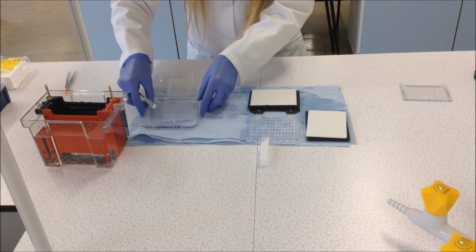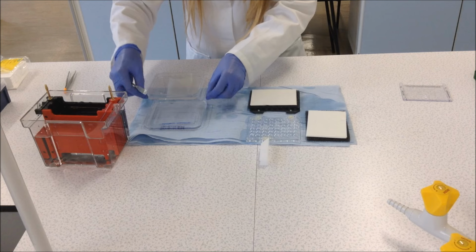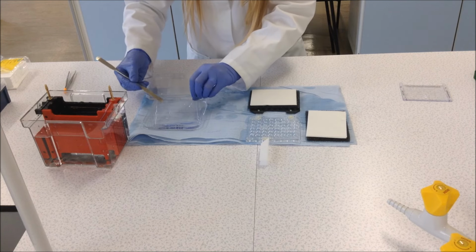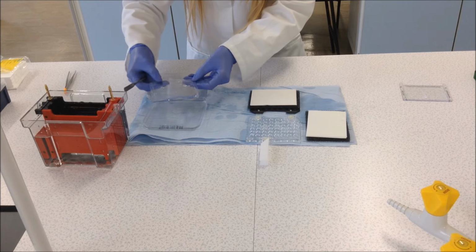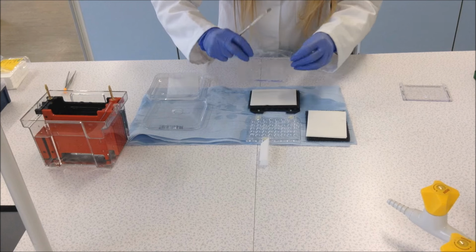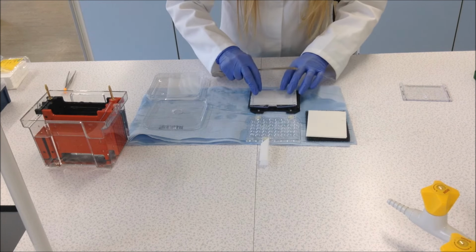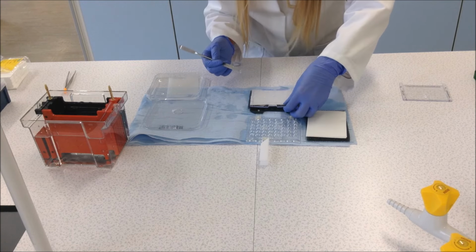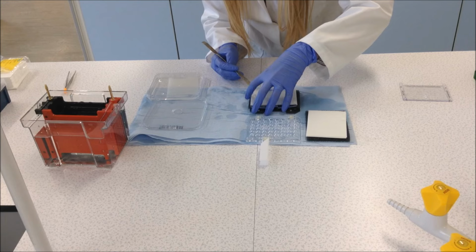With the excess polyacrylamide removed, you can then place the cassette into some buffer to allow the polyacrylamide to loosen, making it easier to transfer onto the blotting paper. Usually the best way to transfer this over is to place the polyacrylamide face down onto the blotting paper, patting it down to remove any air bubbles, and then carefully removing the plastic.